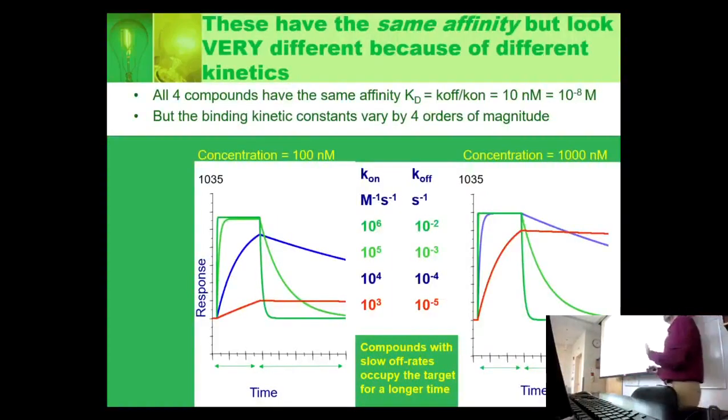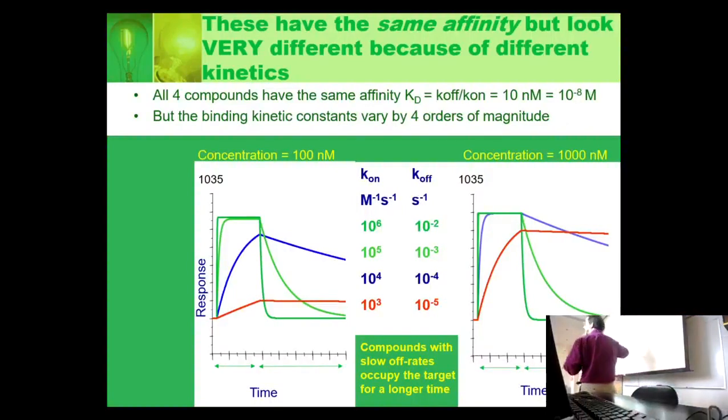The thing to realize is that thermodynamics and kinetics are very different ways, and so you get good information from all of it. A big K constant is equal to 2 little k constants divided. But because they're divided, the ratio doesn't tell you whether it's fast on, slow off, or slow on, fast off. Sorry, because it's dividing, I keep saying it wrong. Fast on, fast off will look the same as slow on, slow off. I need to have the slows together for it to become compensatory because of the dividing. Anyways, we'll talk about all this when we get to it.